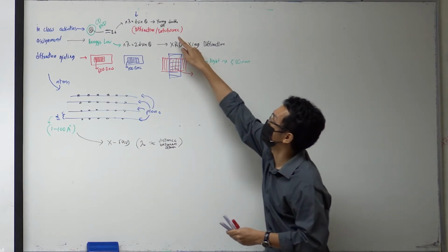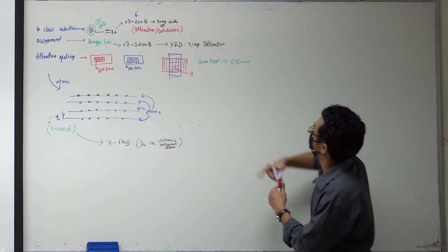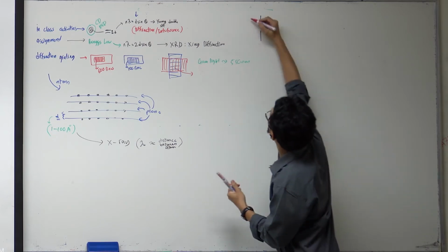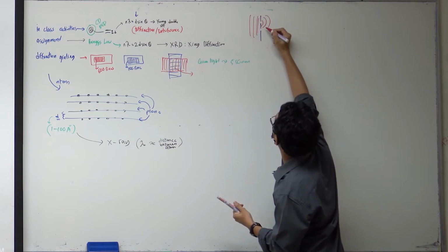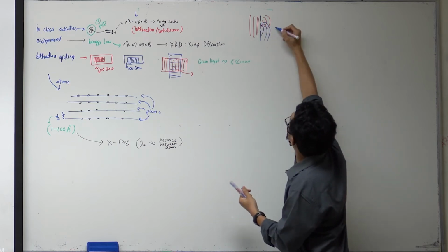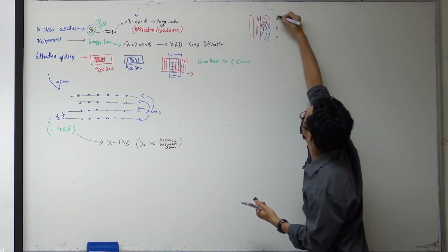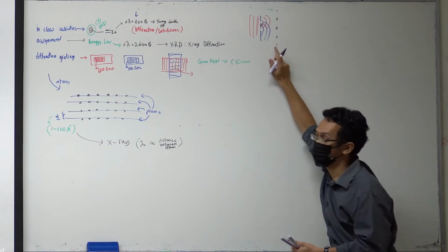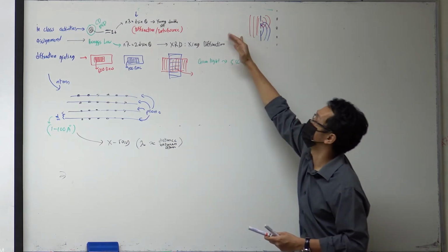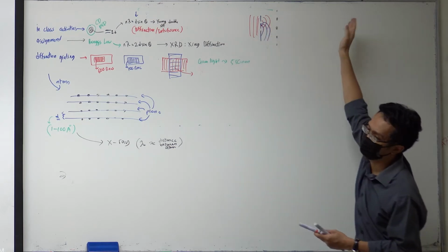exactly like the Young double slit. In Young's double slit, you have two openings and a wave comes in. The wave diffracts and interferes with itself, and you get bright fringes here, here, and so on. XRD is not exactly like this, because in Young's experiment you just expose the slits to the wave, and the wave diffracts and interferes.